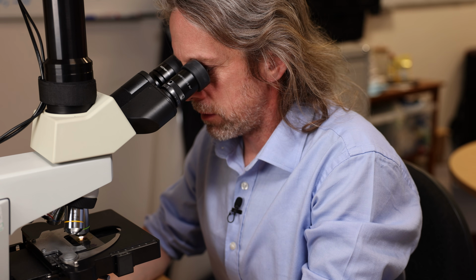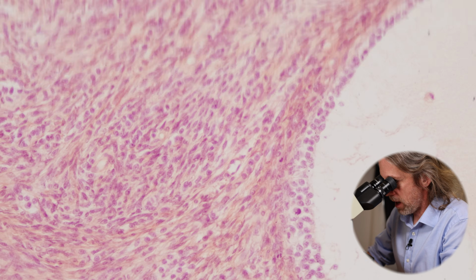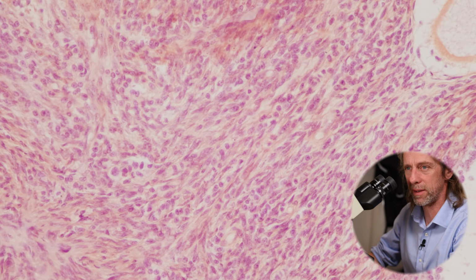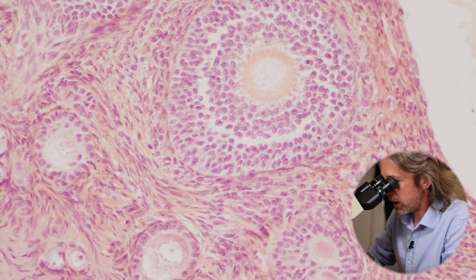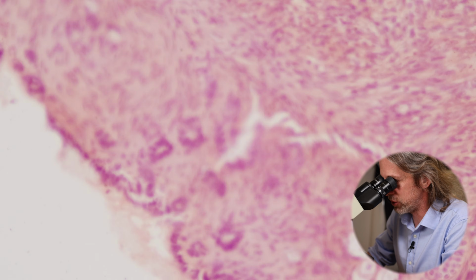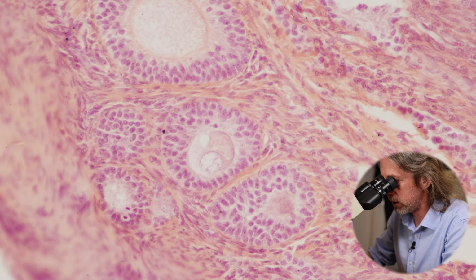All right, now, if we look closely, we can see there, can't we? I'm looking for the zona pellucida. The zona pellucida is a glycoprotein. That's fancy, isn't it? Sugar and protein. It's a glycoprotein covering the oocyte, and its job is essentially to ensure that only one spermatozoon will fertilize it and no others will.